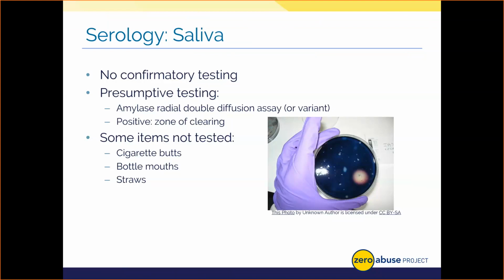Now I'm just going to round off this slide by noting that labs typically don't test items used in such a way that saliva would be deposited. In other words, what I mean is things like a straw, a bottle, or so forth. We take that on straight to DNA, since we can assume that DNA from any of those items is derived from the buccal cells in saliva, unless there are other bodily fluids indicating that something different happened with those items. So just remember then, saliva itself doesn't contain DNA. It's actually the cells in the saliva from our mouths that possess this heritable material.